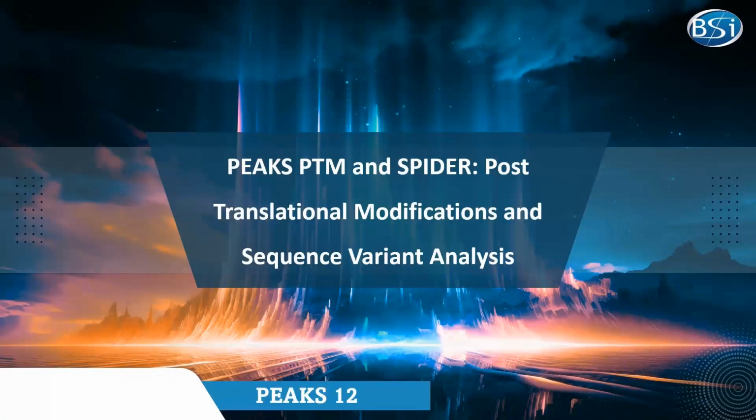Welcome to the PEAKS 12 PTM and Spider video tutorial. In this video, I will explain the PEAKS solution for post-translational modifications and sequence variant analysis, the workflow setup, and how to view the results.